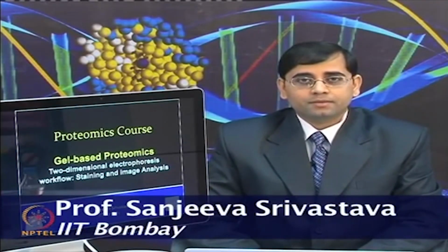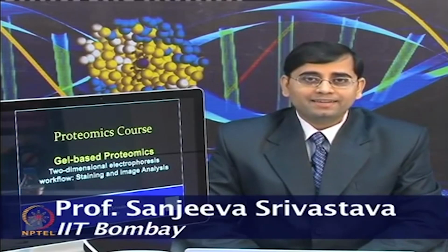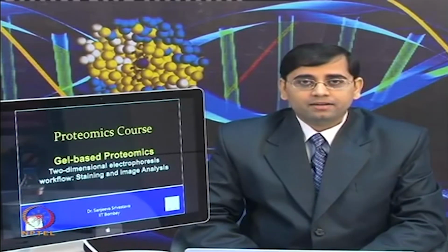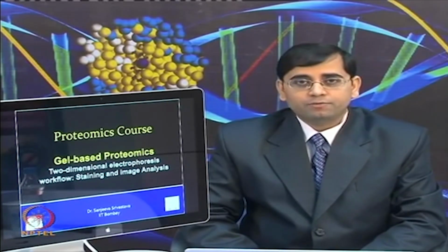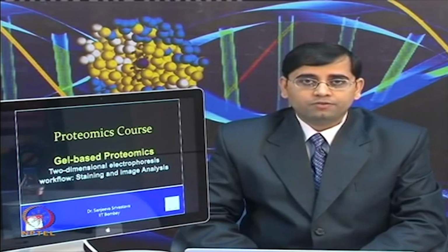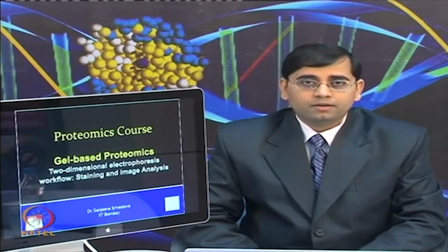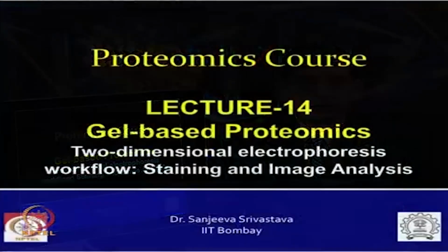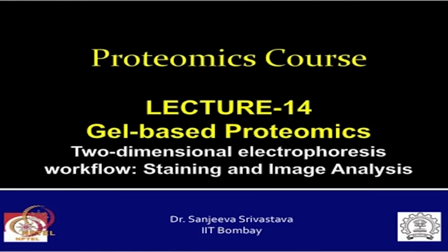So, welcome to the Proteomics course. In the last lecture, we started discussing gel based proteomics, how different techniques are used to separate the complex protein mixtures, and I mentioned that SDS PAGE, blue native PAGE, two-dimensional electrophoresis and various advanced forms of gel based proteomics all together help to study different types of problems by applying gel based approaches in proteomics. We started discussing the workflow of how to perform two-dimensional gel electrophoresis.